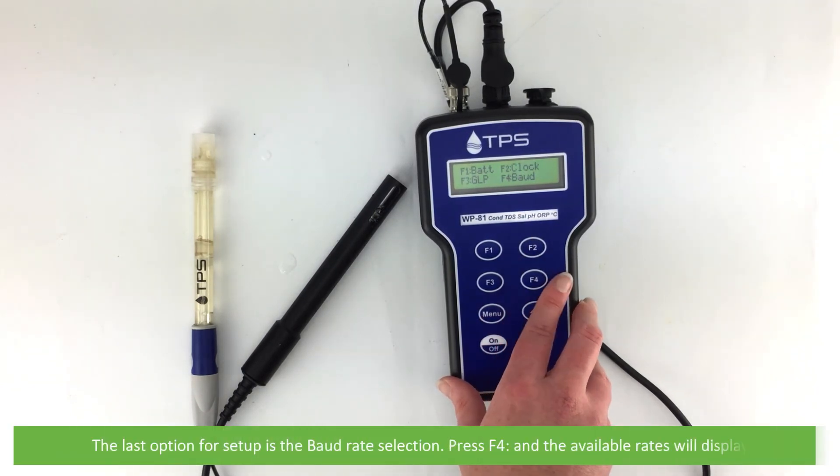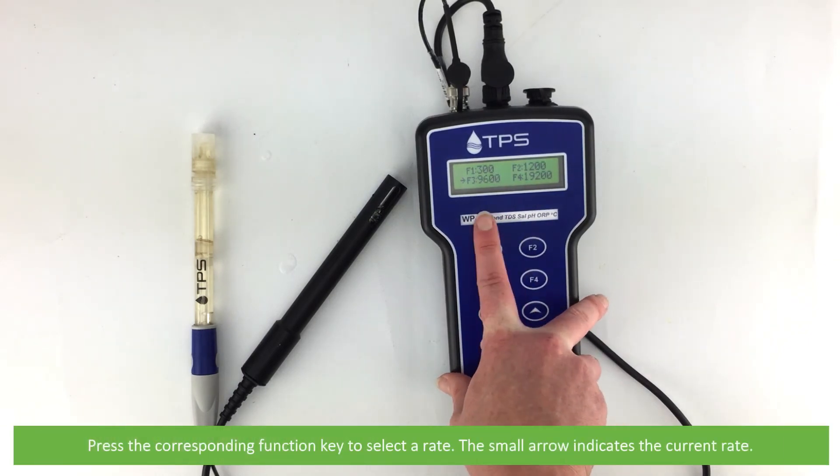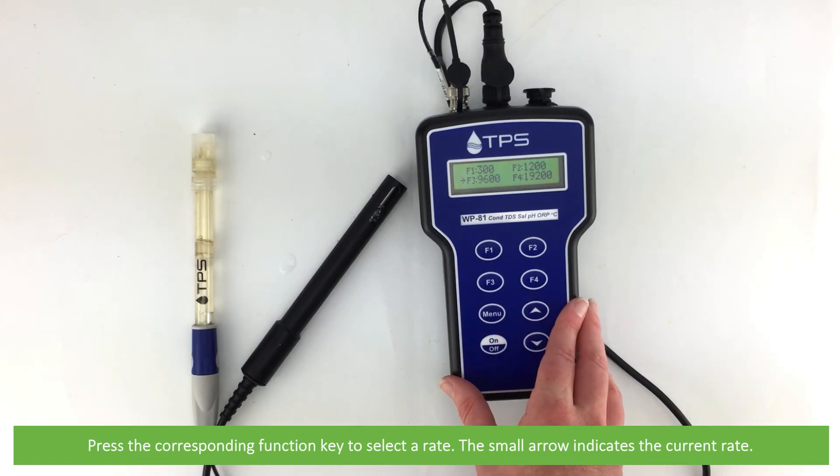The last option for setup is the baud rate selection. Press F4 and the available rates will display. Press the corresponding function key to select a rate. The small arrow indicates the current rate.